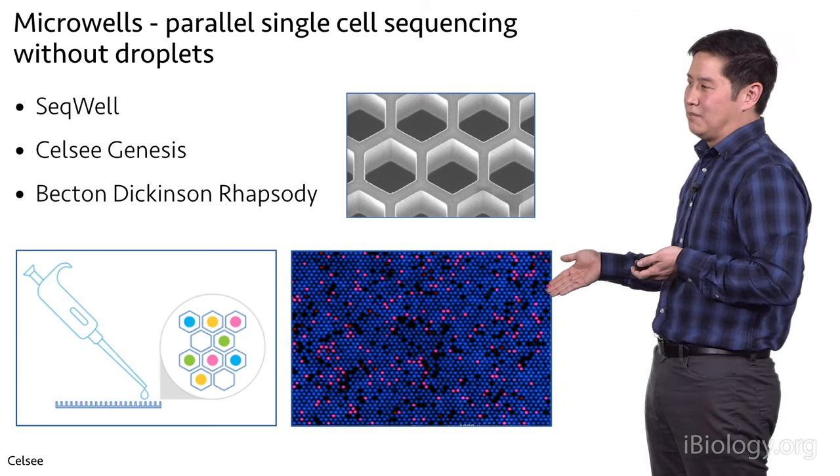of a 96-well plate. At this step, you take your cDNA that's present in each of those cells, and then you do a different reaction that will then add a second barcode. Again, each of the cells in each well will receive the same barcode, but chances are each cell in this well came from a different well in this first plate. With this combination of barcodes, with 96 and 96, you have about 10,000 combinations. If you're only sequencing about 1,000 cells, you don't have a very high chance of having two cells with the same barcode.